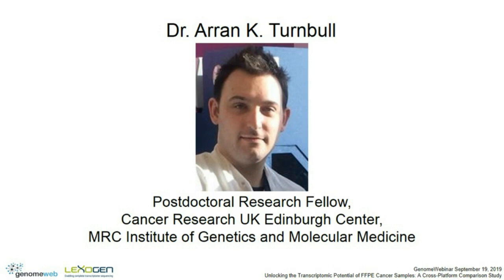So as a researcher approaching this question, my main focus was, can I get usable data from FFPE tissues, especially older tissues with maybe 10 or 20 years follow-up, when we know that RNA degrades over time? So this is not going to be a technical or a very comprehensive comparison of these technologies. This is basically going to be a series of trial experiments that we performed in order to find a technology that would address our needs.